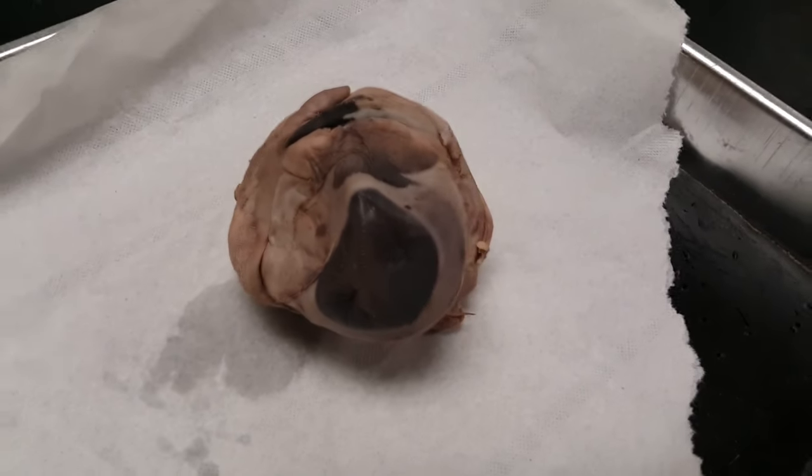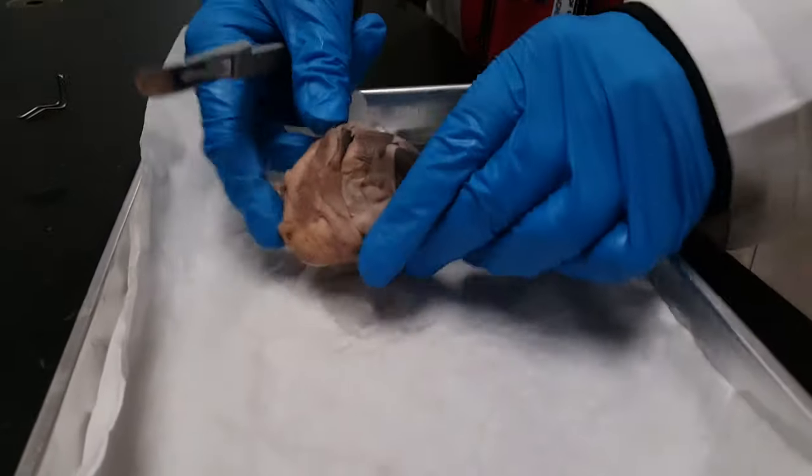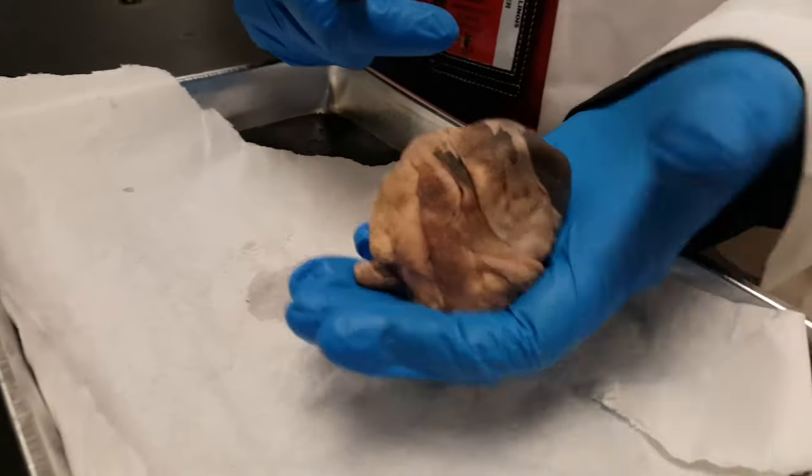We are going to show how to cut a cow eye. First, always keep the eye in the tray — do not hold it in your hand when you're cutting.